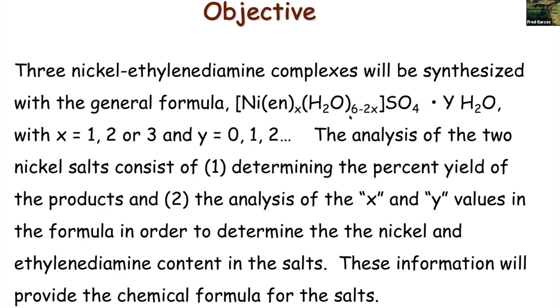And the formula is going to be 1, 2, or 3 ethylene diamine. Ethylene diamine, EN, is short. It's an abbreviation for an organic chemical that will latch on to nickel.